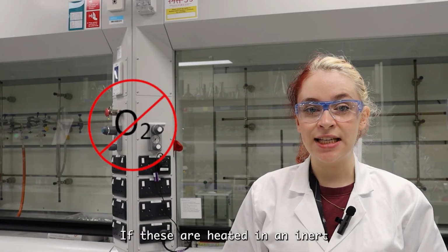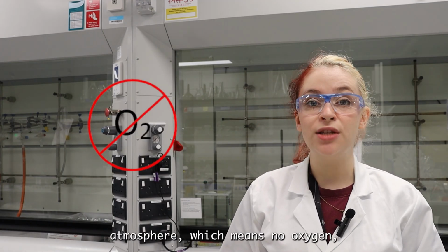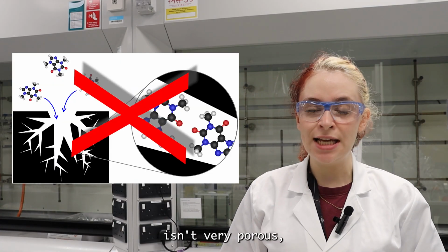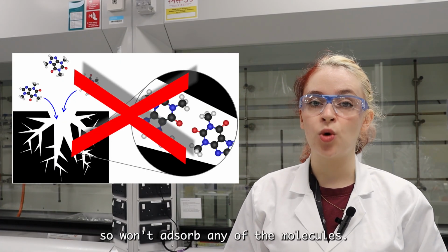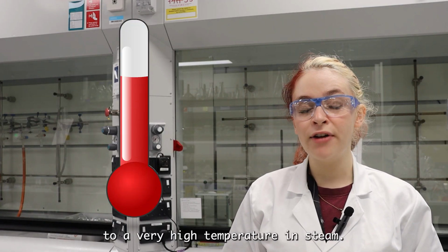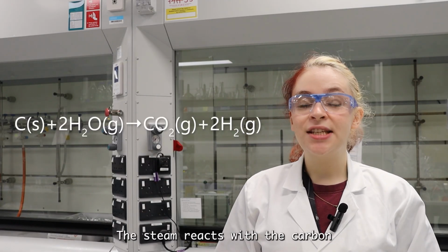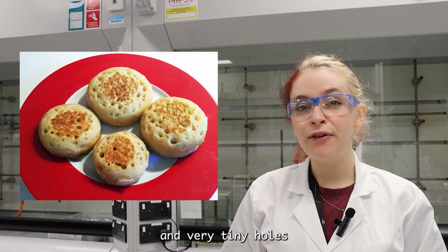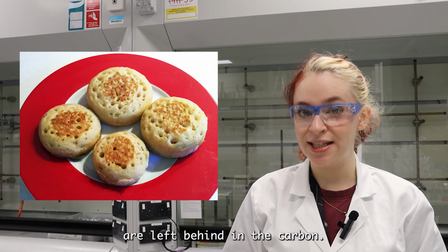If these are heated in an inert atmosphere, which means no oxygen, they will turn into carbon. However, the carbon that's produced isn't very porous, so won't absorb any of the molecules. Instead, the biological materials are heated to a very high temperature in steam. The steam reacts with the carbon to make carbon dioxide, and very tiny holes are left behind in the carbon.